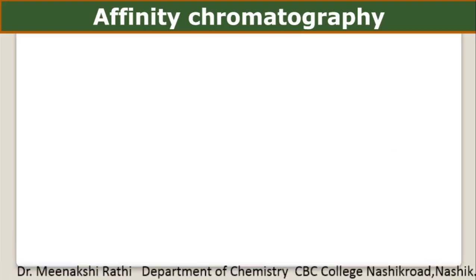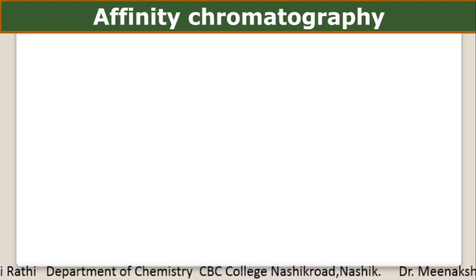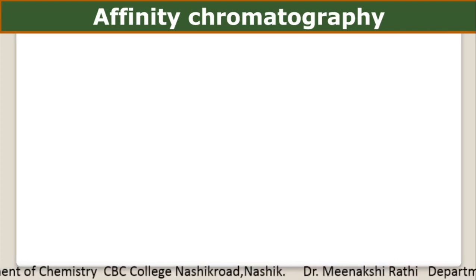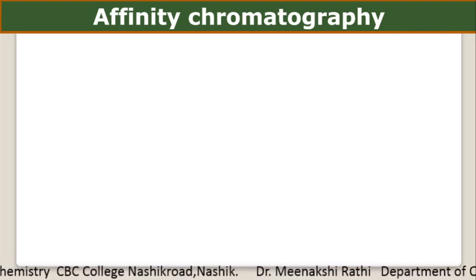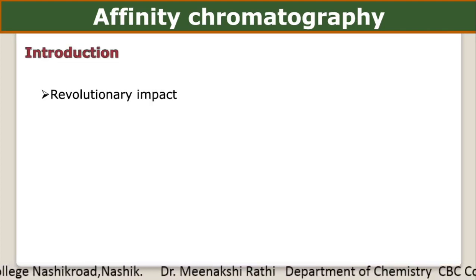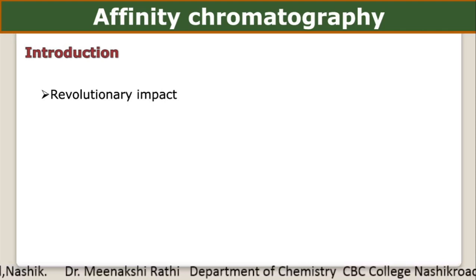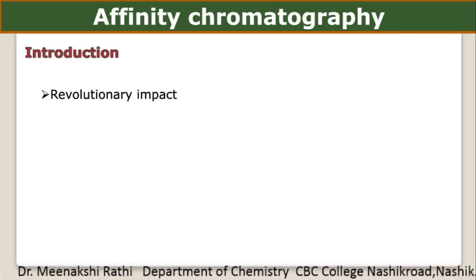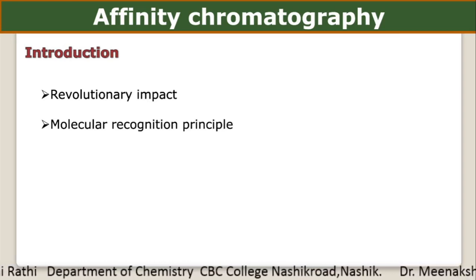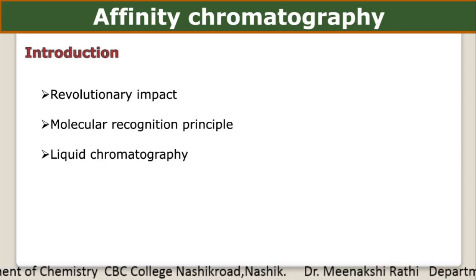Now the next chromatography is affinity chromatography. As per its name, there is an affinity between the molecules which we want to separate and the column which is prepared. This technique has a revolutionary impact on modern biological science. This technique is based on the molecular recognition principle, and it is an example of liquid chromatography.